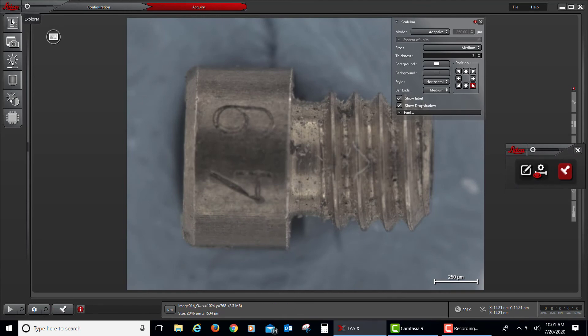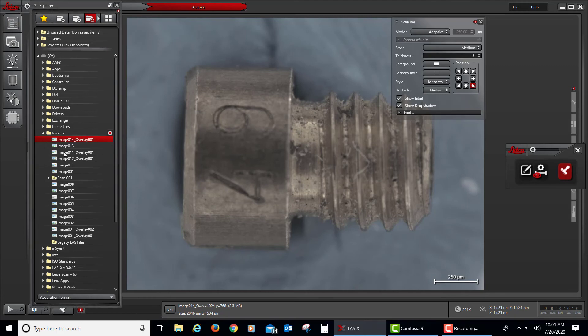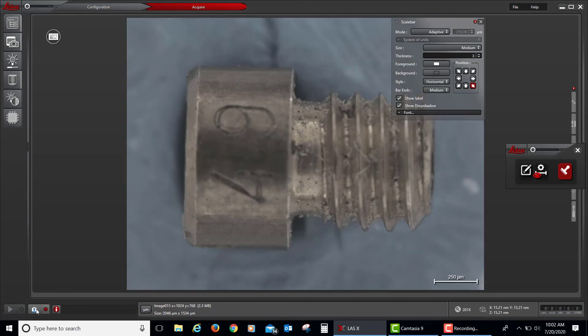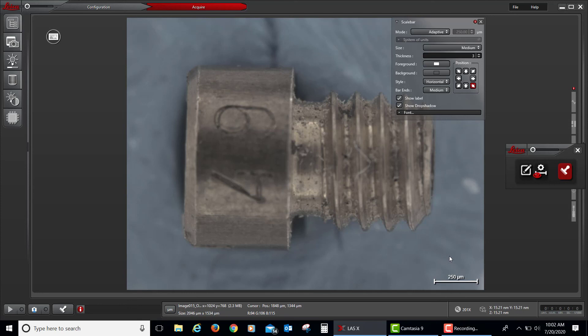The other way is to go to the navigator, click on the previous image where I do not have a scale bar yet, and then click on the button to acquire that image with the overlay built in. So now I have the same image, only with the scale bar on it. So you do not need to remember to add a scale bar or to remember to burn a scale bar into your image prior to acquiring.